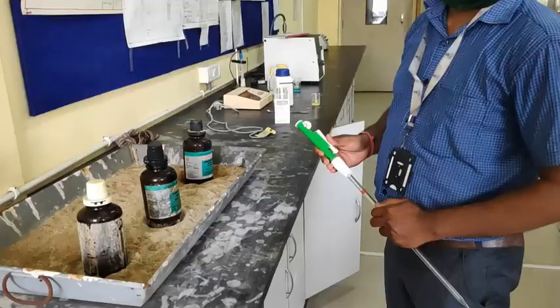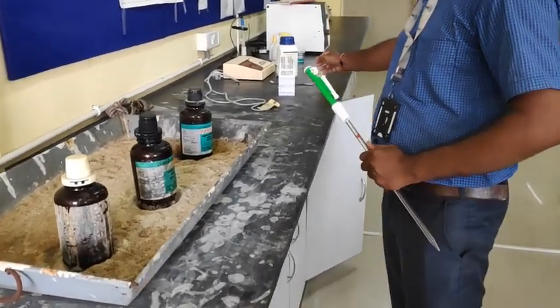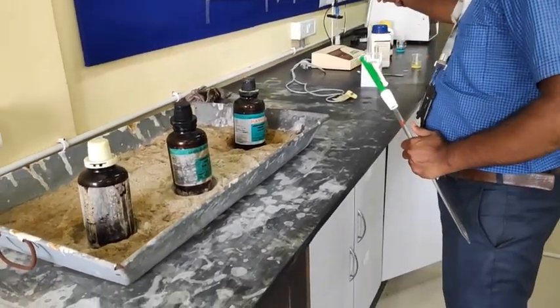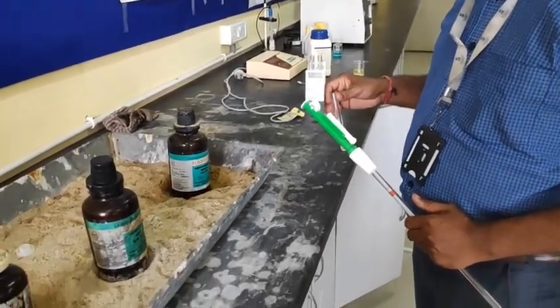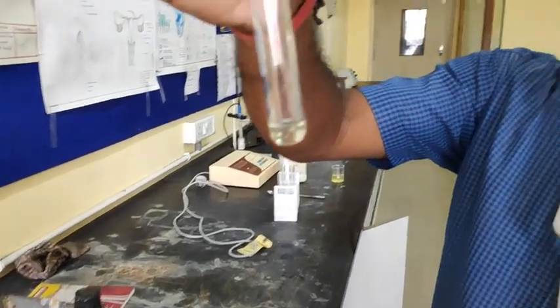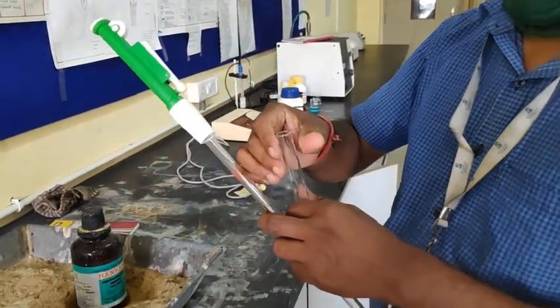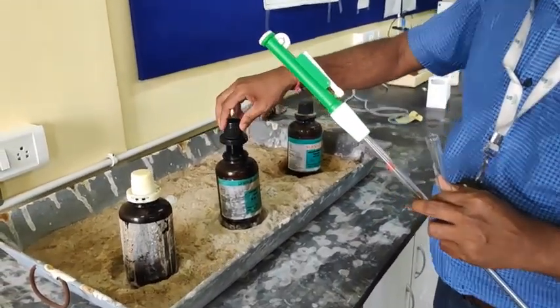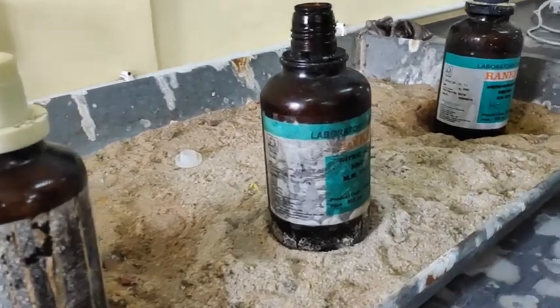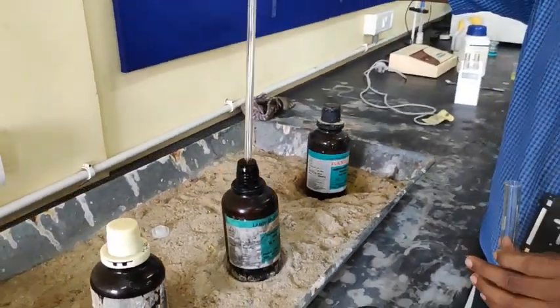Stay tuned. The first step of this reaction is to pipette out some amount of nitric acid. Here in the test tube we have a sample solution. Can we see the sample solution? Okay, we can see the sample solution present here, and now we are going to pour some nitric acid. So this is nitric acid, a concentrated nitric acid.